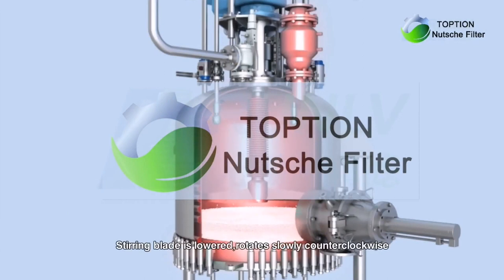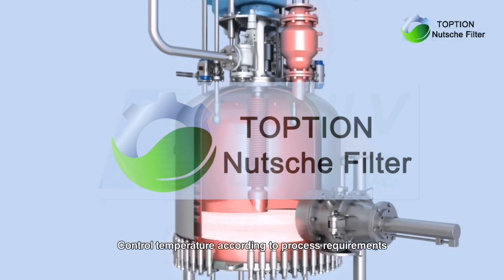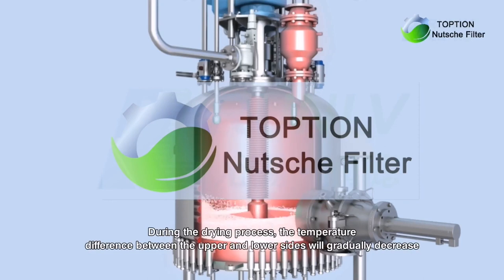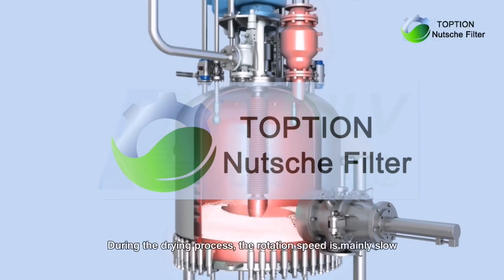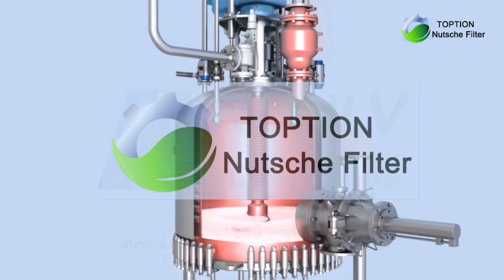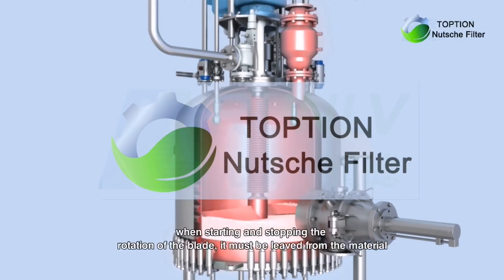The stirring blade is lowered and rotates slowly counterclockwise. Control temperature according to process requirements. During the drying process, the temperature difference between the upper and lower sides will gradually decrease. Vacuum degree increases as the moisture decreases. The rotation speed is mainly slow; when starting and stopping the rotation of the blade, it must be relieved from the material.